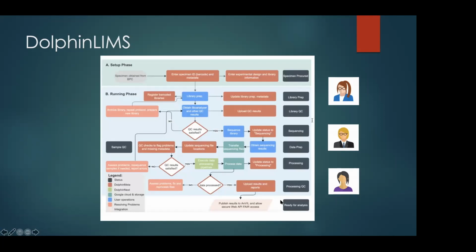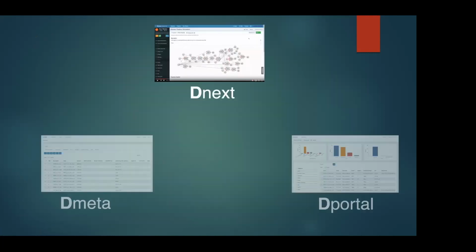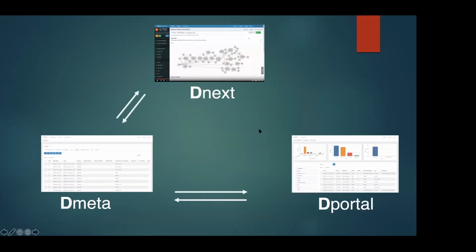So we created this kind of system to track metadata together with all the process data information. In the future, you can think of your own projects: if you have a special large project coming from different people, different organizations, different geographical locations, you can define people. For example, you collect data from different parts of the US.